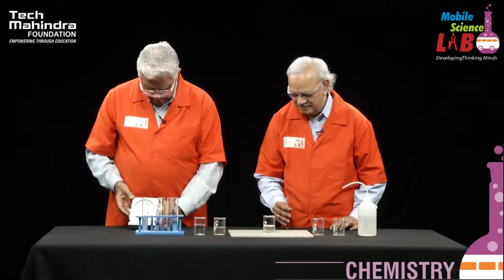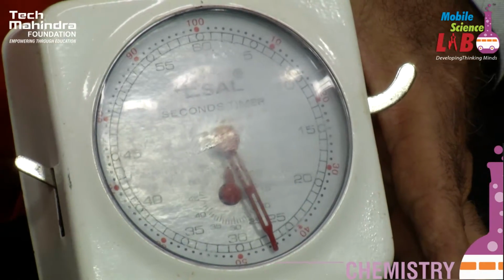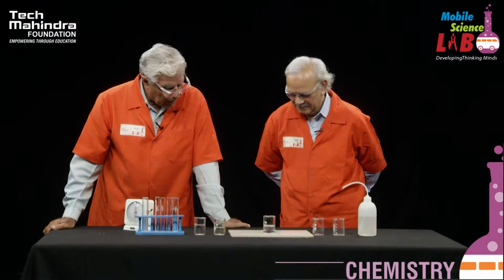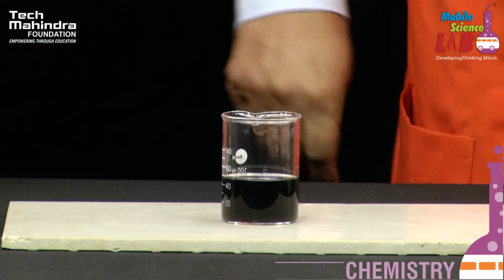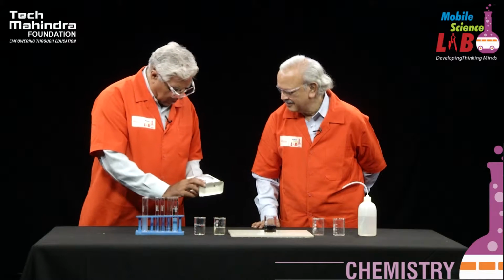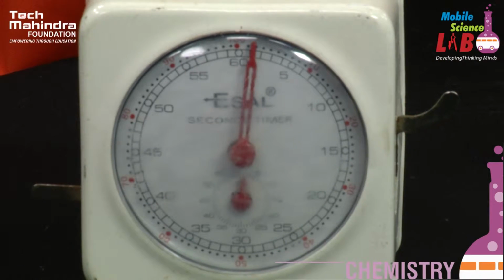Keep watching. That's a color. Okay. This is a starch iodine complex, characteristic color, and it has come after how many seconds? 60 plus. It has come to almost 61 seconds. That's an excellent timing. This is a very nice timing for a clock reaction, about 1 minute reaction.